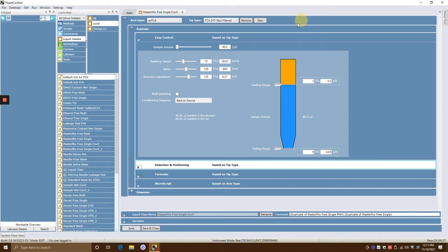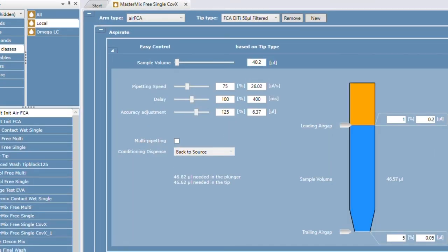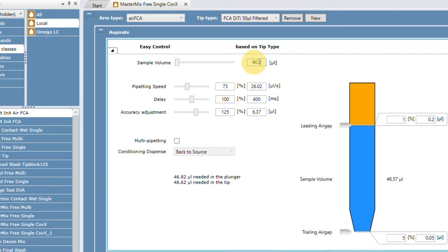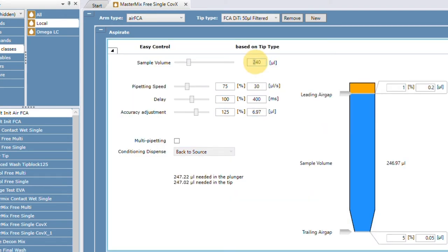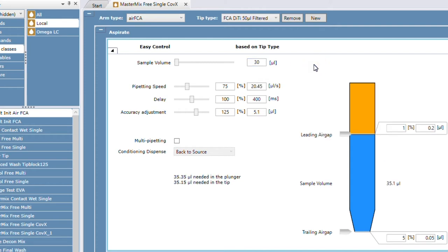Today we're just going to be working on the 50 microliter filtered tip as an example. The sample volume here is just what it would look like at this sample volume. It doesn't mean you're pipetting this volume — it just means if we were doing a pipette of, say, 20 or 30 microliters, this is kind of how everything would look.